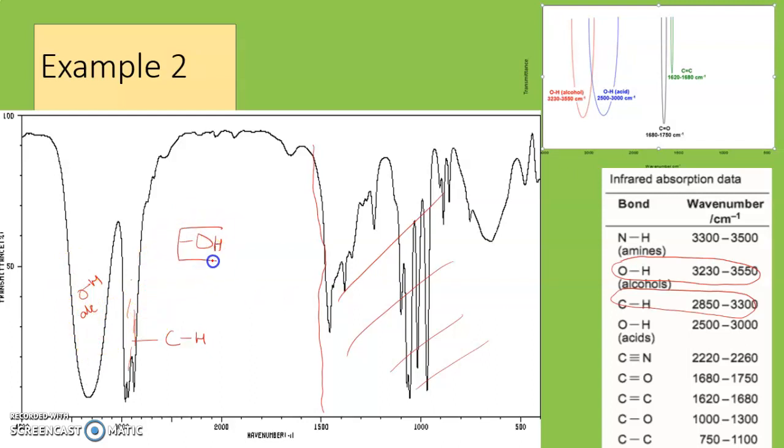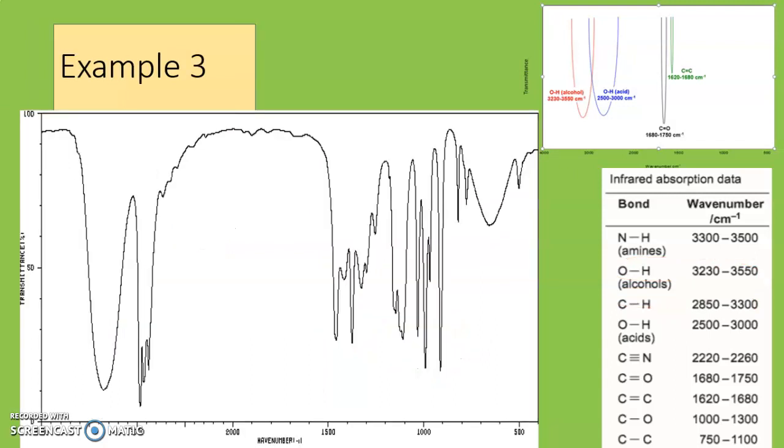So I know this is a functional group for alcoholic compounds. So if I have to do a chemical analysis, I could do a test on the functional group of alcohol and find out whether it's primary or secondary. So I can do the potassium dichromate test, oxidation, orange color turning into green, or then if it's a secondary alcohol, I could do further testing once I get the oxidation product.